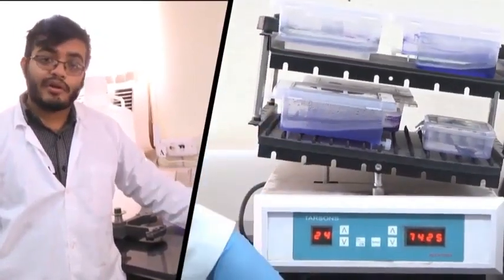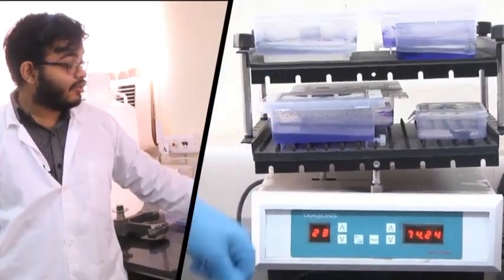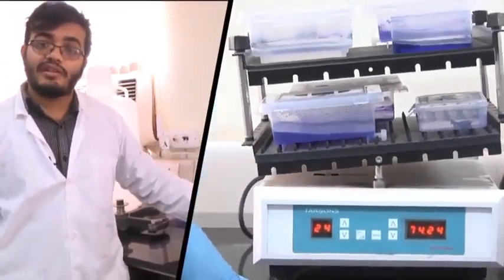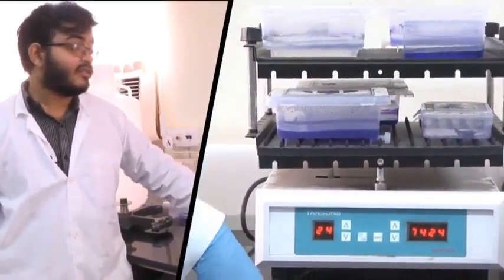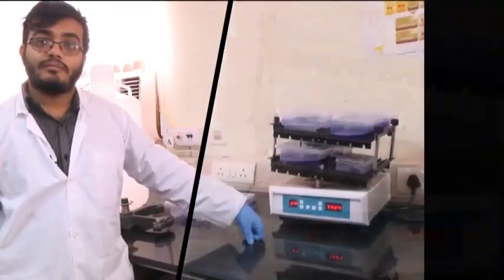So I understand that you might not be familiar with many of the experimental terms that I used, but that is not the point at this moment. What I want you to realize is we have instruments which ensure proper mixing of different liquids onto solid surfaces or between each other via this gel rocker.